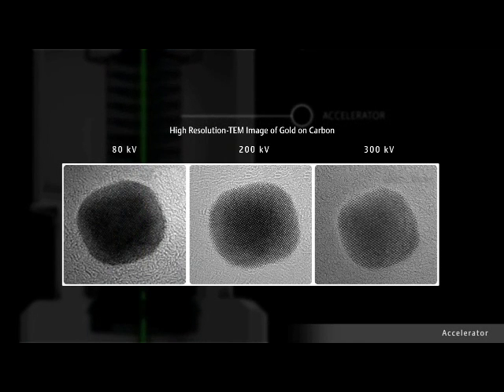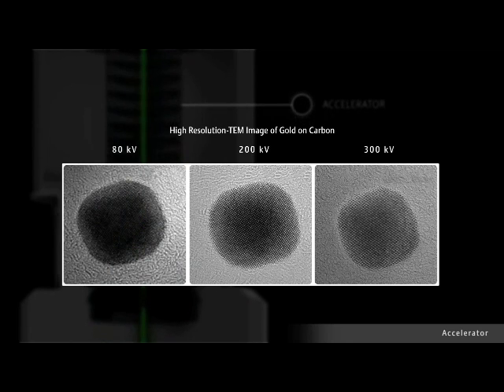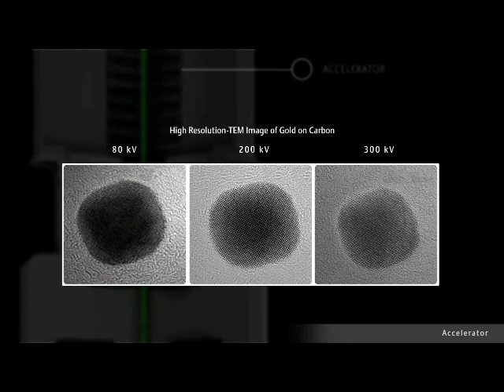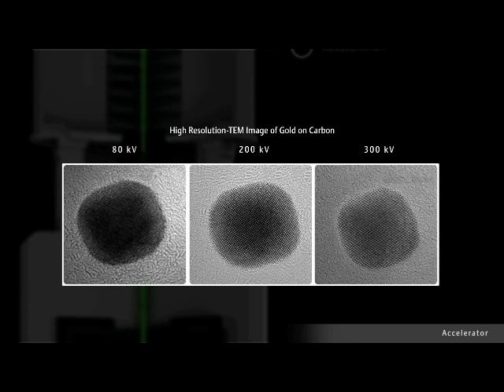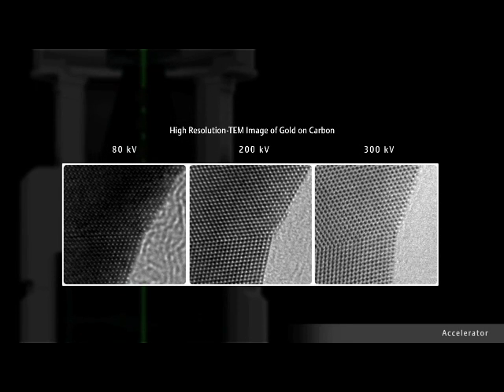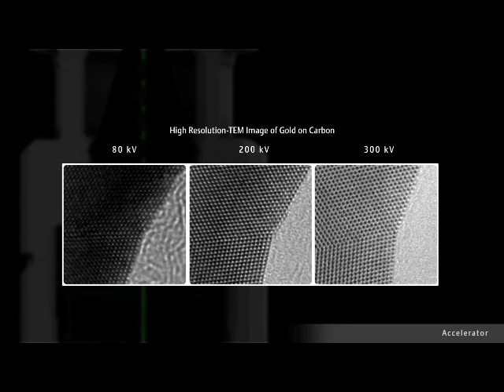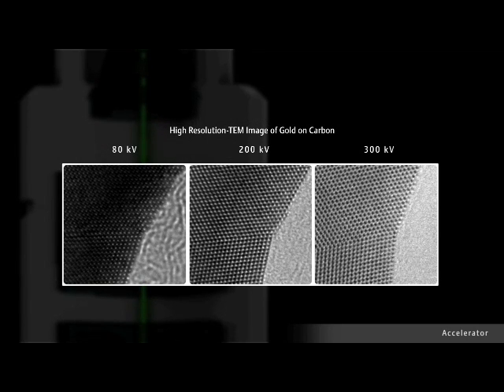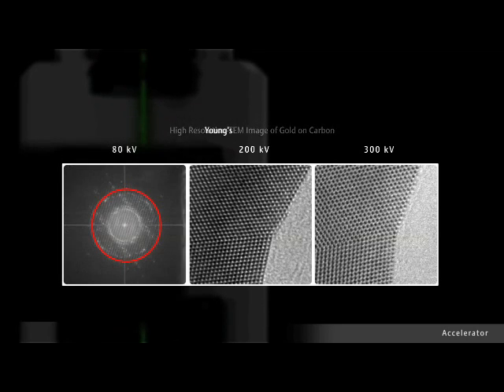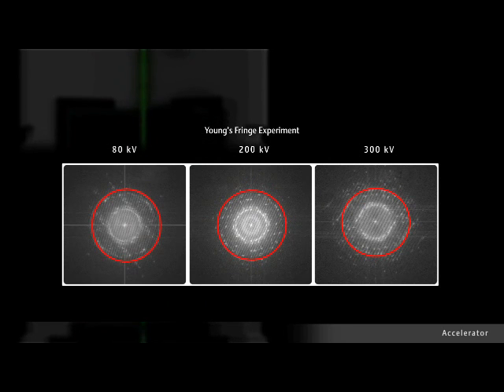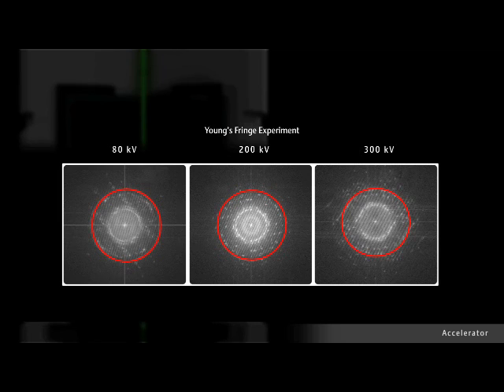This technology, in combination with CS correctors for STEM, delivers unprecedented atomic resolution performance for structural research across the entire acceleration voltage range of 60 to 300 kilovolts. Here you can see the atomic resolution is preserved across the acceleration voltage range, shown in the atomic images of gold acquired at different voltages. Young's fringe experiments show the stability of the deep sub-angstrom information transfer across the acceleration voltage range.